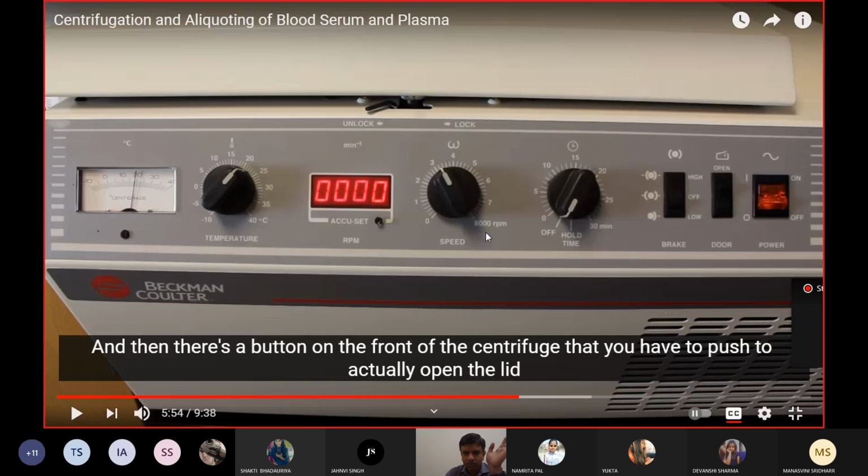So again, they are very expensive. You won't see them in the normal laboratories, okay? But you will just see these kind of centrifuges in the labs. You have to push to actually open the lid. So there's two different locks here. So once both those locks are undone, you can lift the lid, take the samples out, and you can use them however you plan on using them.